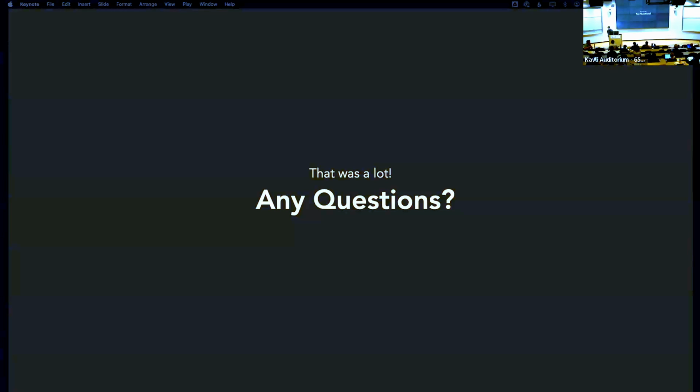It's a really interesting question, and one that I think it's really fun to play with. In this particular case, I just trust the authors to say there's sometimes two, but you can actually do a bit of counting. What you can do is symmetry expansion, which is one of the ways of handling symmetry where you create n individual copies of these images that are rotated.